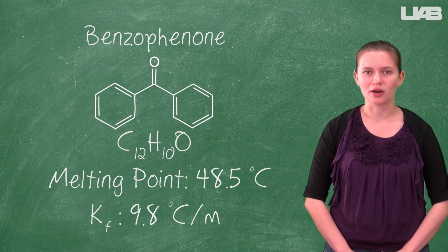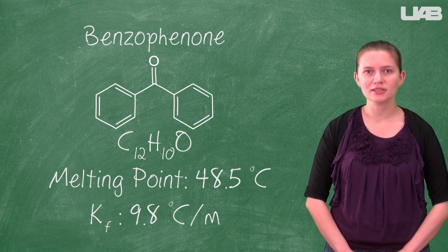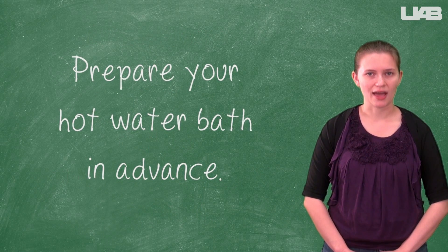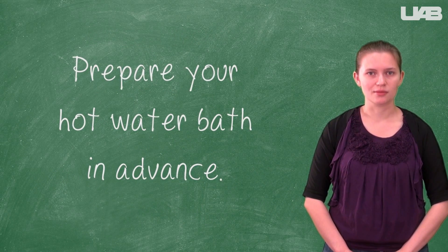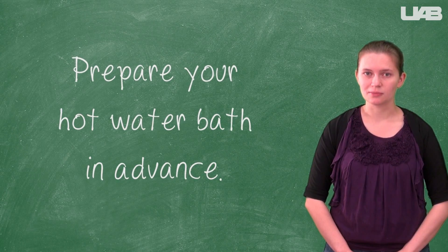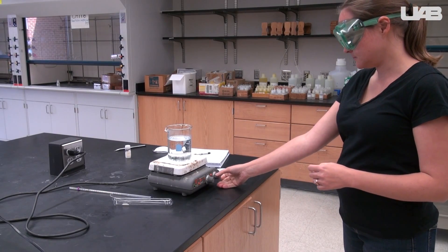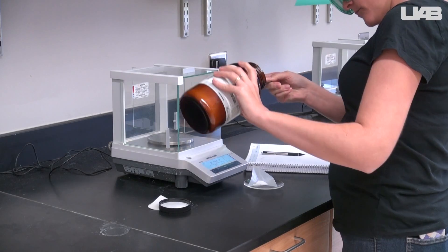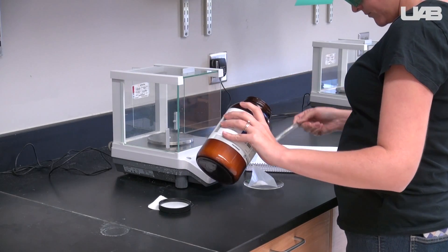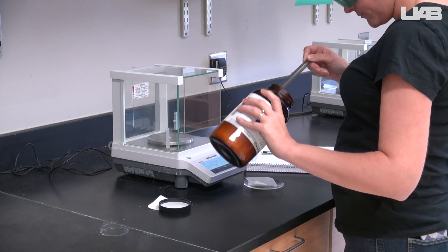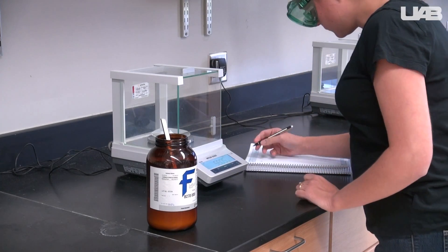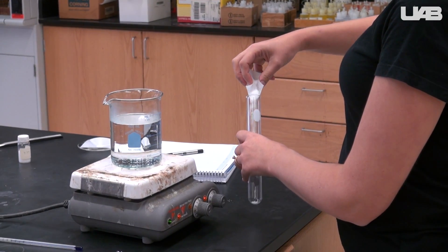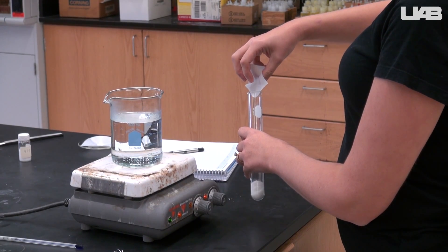In Exercise 1 you will be observing the freezing point of pure benzophenone. You will need a hot water bath at a later point in the procedure, so before starting put a beaker of water on a hot plate and let it begin heating. You will begin by weighing out about 5-7 grams of the benzophenone and recording the mass in your notebook.